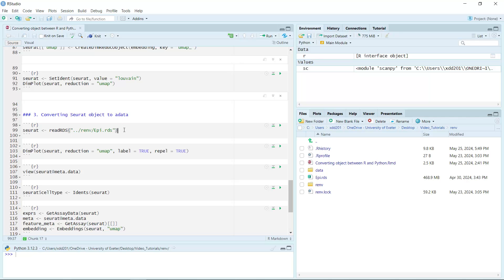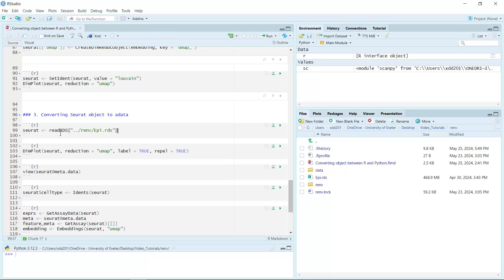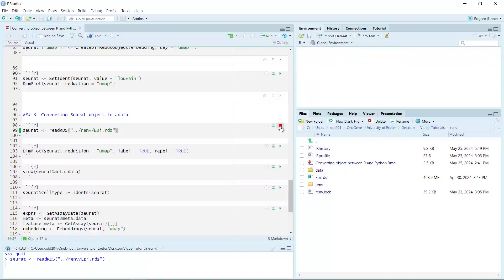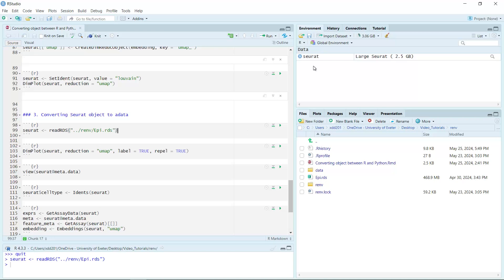You can see here I have analyzed the non-epithelial cells RDS Seurat object. We can read this Seurat object in. You can see in my R environment window we have a large Seurat object.